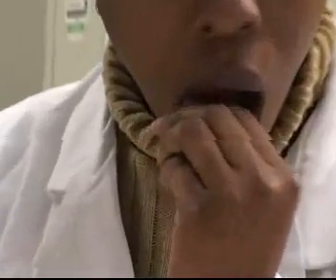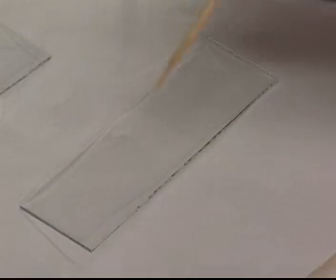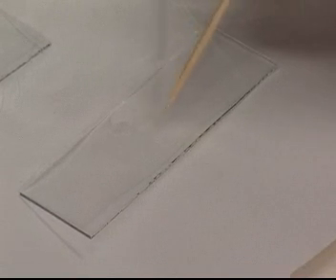Now, gently scrape the inside of your cheek or the inside of your lip with the broad end of a clean toothpick. Make sure you do not dig too deeply or you will cut yourself. Also, take care not to just pick up the white substance between the teeth, called plaque. Use the toothpick to transfer the scraping into the drop of water on the glass slide.